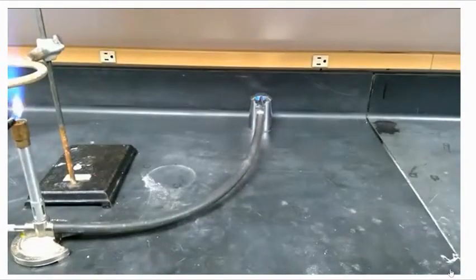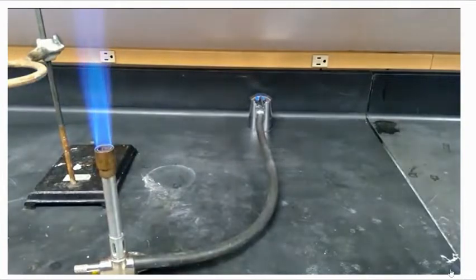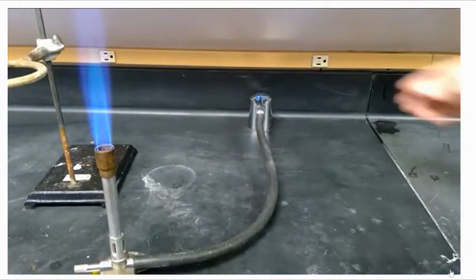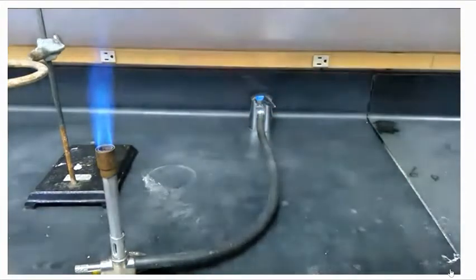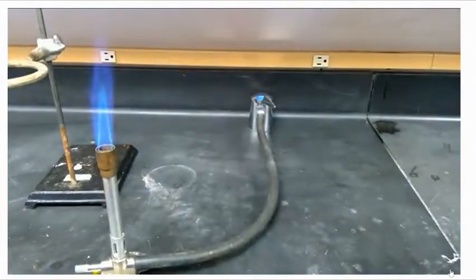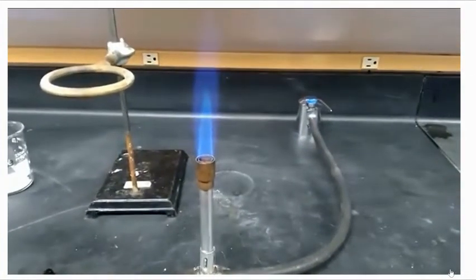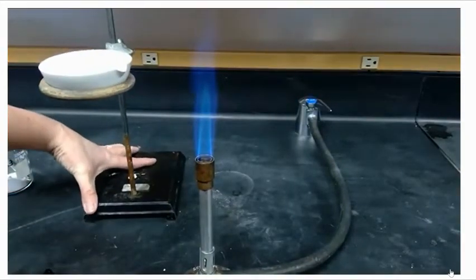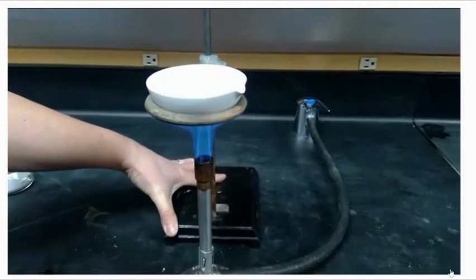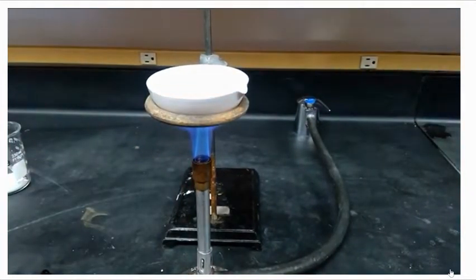We're going to turn on the Bunsen burner, and again, we'll adjust it so we have a nice tight inner blue flame as well as an outer blue flame. We're going to put the evaporating dish in the ring stand, and then we're going to put it under the Bunsen burner, making sure that that outer blue flame is in contact with the evaporating dish.